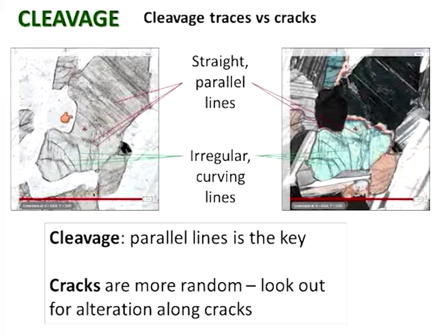So in this mineral, on the left-hand panel, the plain polarized light panel, you can see that these lines are so faint and so fine that it really is almost more a suggestion, like the grain in wood. Those are the slanting lines running from northwest to southeast across that crystal. And then maybe this is a twin, or it might be just two crystals stuck together. If you look in the cross-polarized light view, you can see that there are two crystals with very different orientations. And so, lo and behold, in that lower crystal, the cleavage lines run more or less north-south, at a very different orientation. But they're very discontinuous, so you only really see very faint and very short lengths of them.